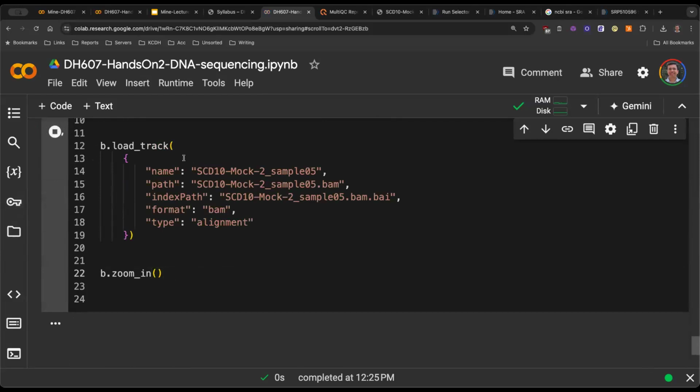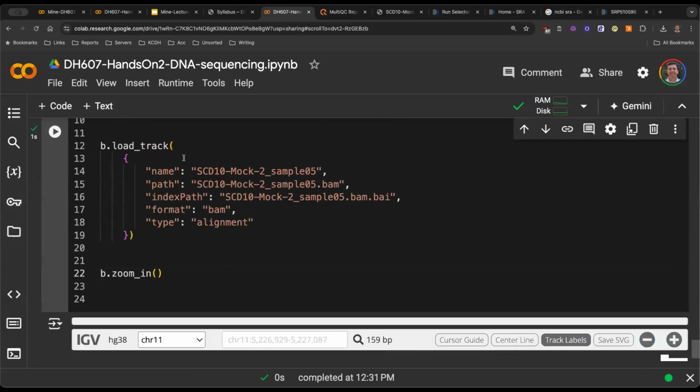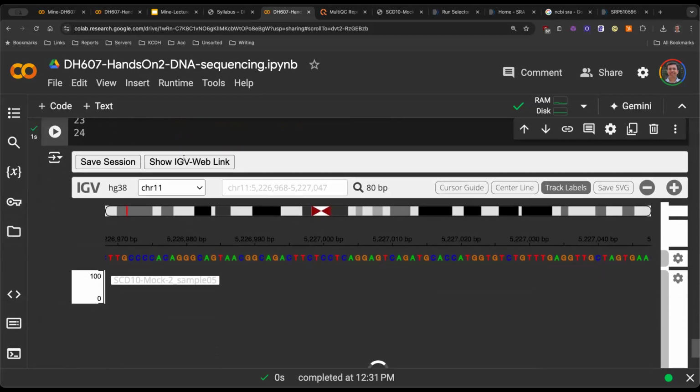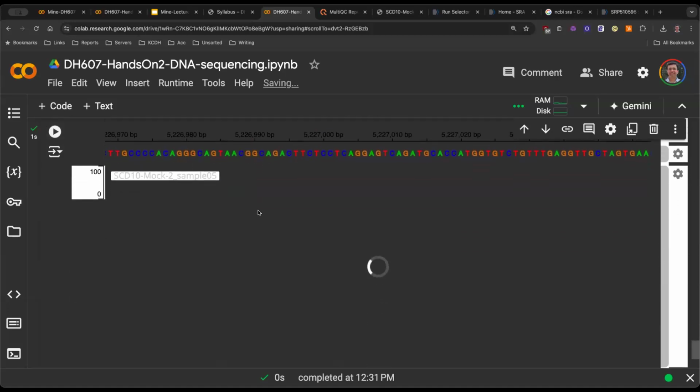And the way you get confidence is by looking at these sequences vertically aligned to each other. The more reads that you see which have A, that is the level of confidence that you get. So what you're seeing here is exactly what is done in a lot of companies or startups, trying to figure out what mutations you have so that you can be put on one or the other therapeutic regime. So now you are also a genome data scientist. You can figure out which mutations exist in your genome.